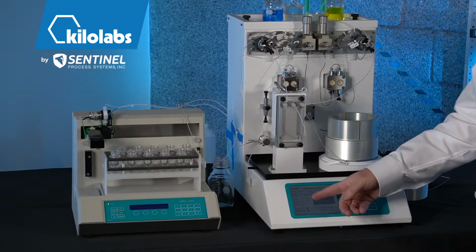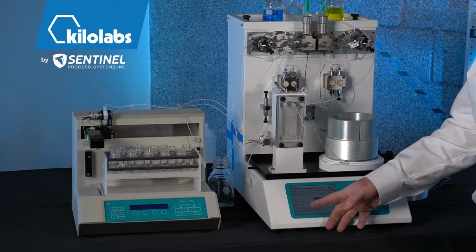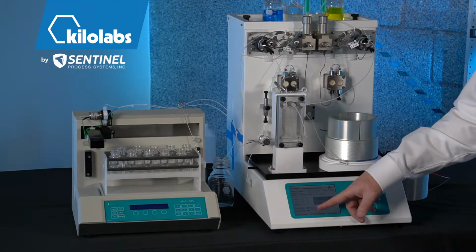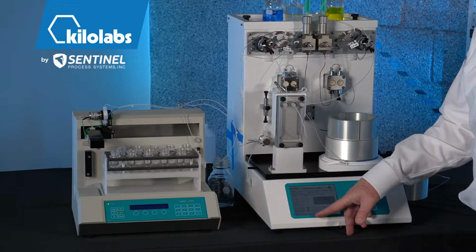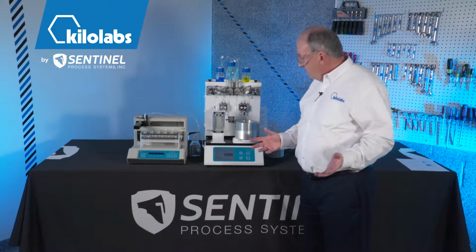The coil temperature is at 22 degrees C, the other coil is at 22 degrees C, and the pressure is 7.6 bar. This progression bar down here tells you that you're on your first experiment, 1 of 10, and there's 7.5 minutes to go for the first experiment. And out of the 10 experiments, the way I've set up that table, it's going to take 1 hour and 16 minutes to go through all 10 experiments. So in essence, we've started.